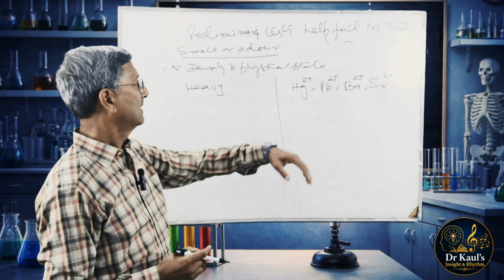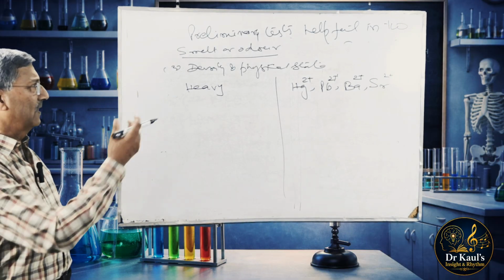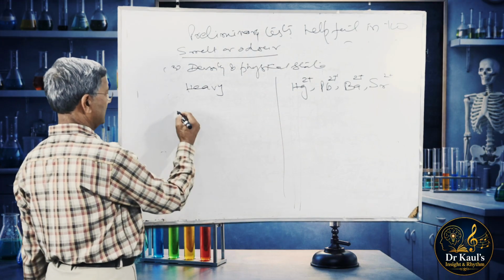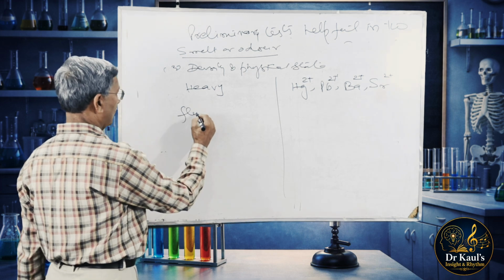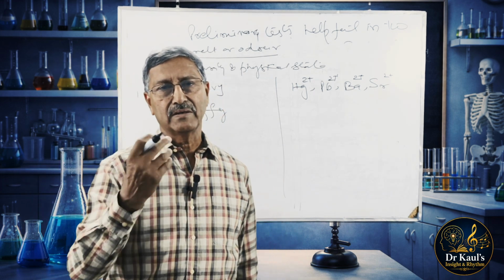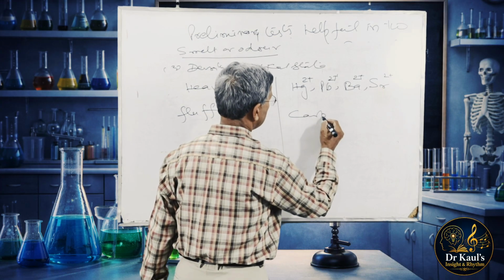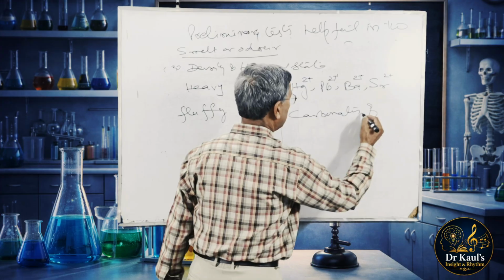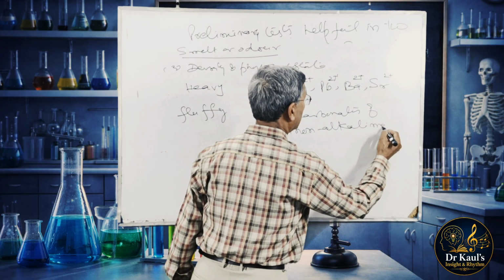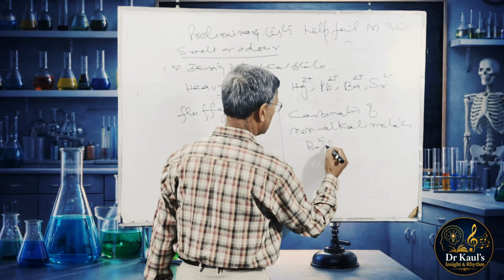So if we get the slight heavy feeling, then the salt could be any among these salts. Then there is physical state. If the salt is fluffy, very light like talcum powder, then it could be due to carbonates of non-alkali metals, basically those of barium, strontium, and calcium, etc.